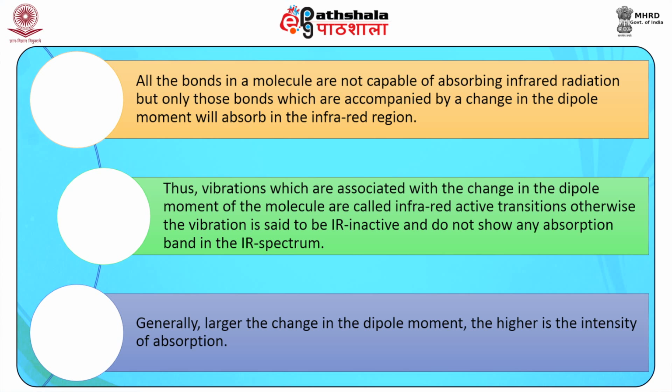All the bonds in a molecule are not capable of absorbing infrared radiation, but only those bonds which are accompanied by a change in the dipole moment will absorb in the infrared region. Thus, vibrations which are associated with a change in the dipole moment of the molecule are called infrared active. Otherwise, the vibrations are said to be IR inactive and thus do not show any absorption band in the IR spectrum.